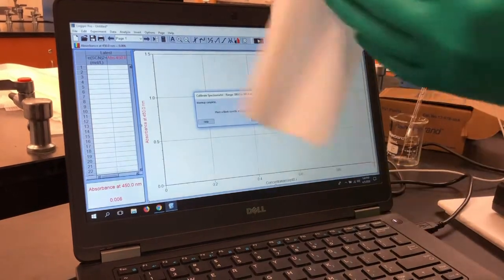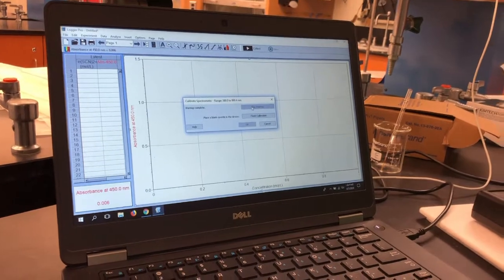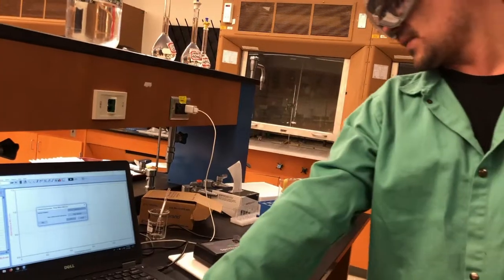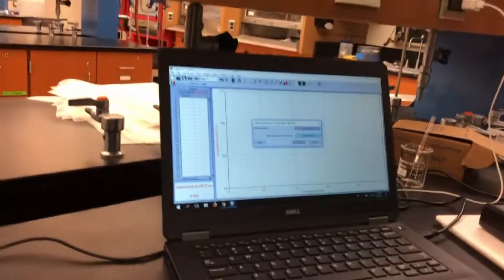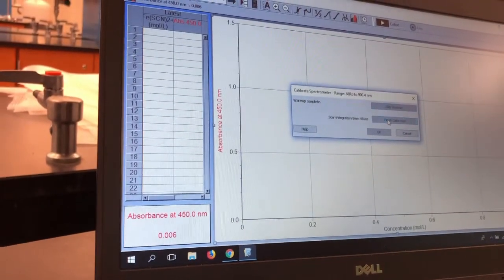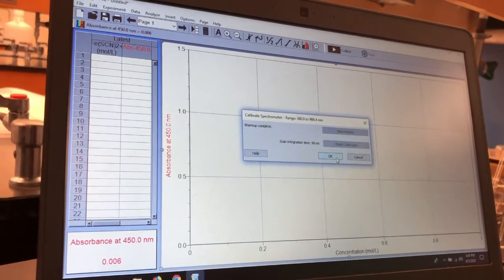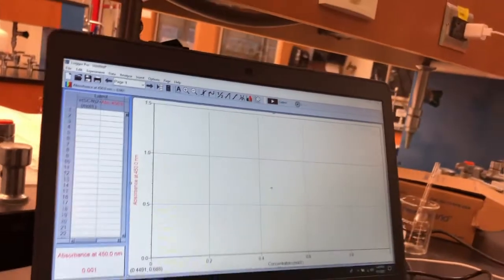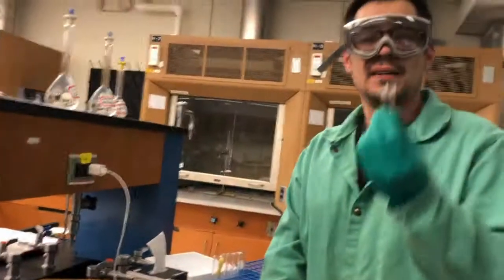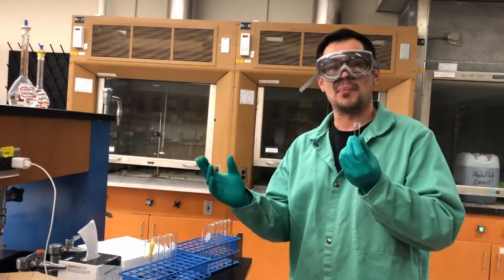as you're familiar with, of course, wiping it to make sure we have no smudges, grease, or anything like that. That'll cause the light to scatter, and then will give us a false absorbance reading. So once the calibration goes through, it should set our absorbance to as close to 0 as it can get. And then once I push OK, you see that drop down to 0. Obviously, there's no iron, there's no thiocyanate in the solution, and that is why we're not going to see the colored complex, right?